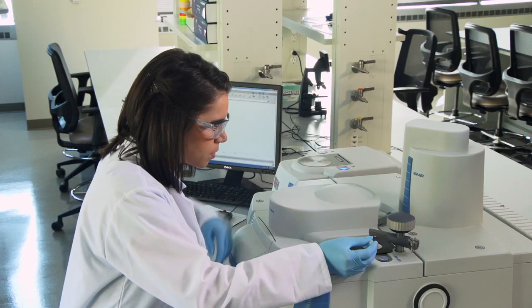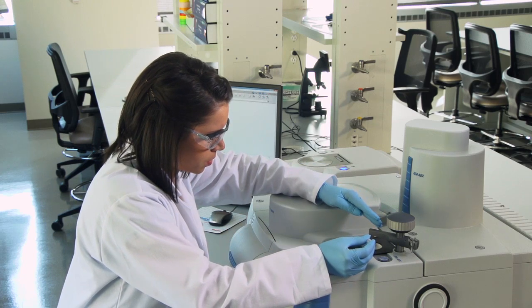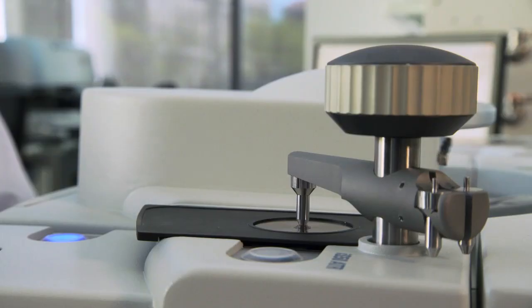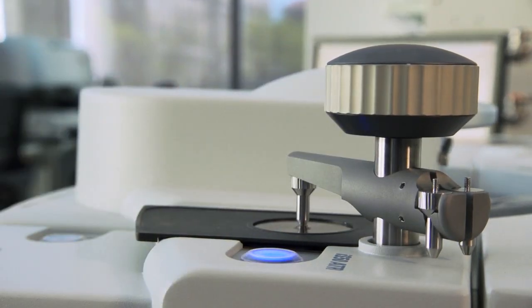And quickly and seamlessly analyze pigments in paints and plastics with mid to far infrared. Just prepare your sample, press the touchpoint, and the Nicolet IS50 automatically does the rest.